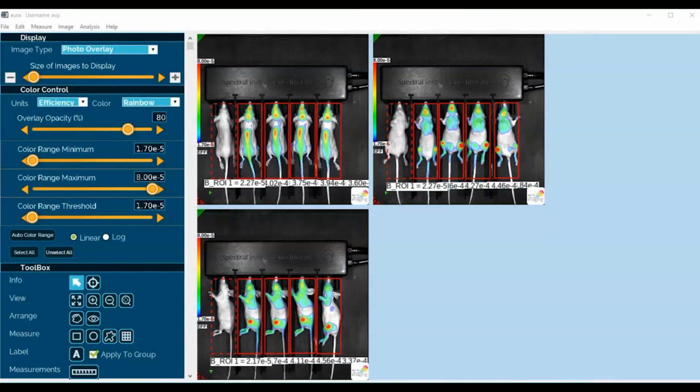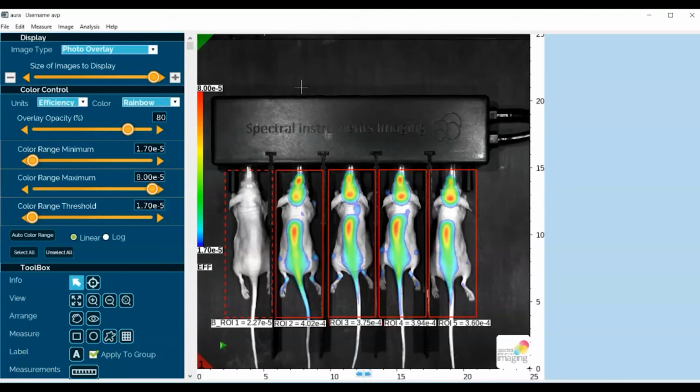Now, to wrap up on this image training session, I'll mention two final protocols that are good for image record keeping. The first is image annotation, and the second is the capturing of pictures of your images that are of interest. Now, with regard to image annotation, let's just double click on one image.